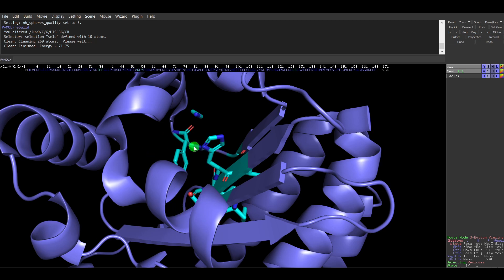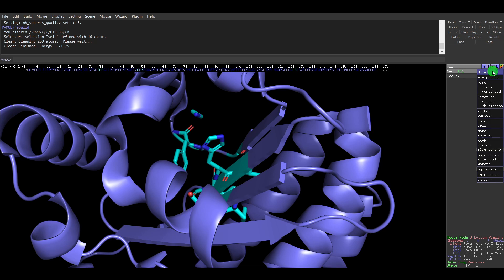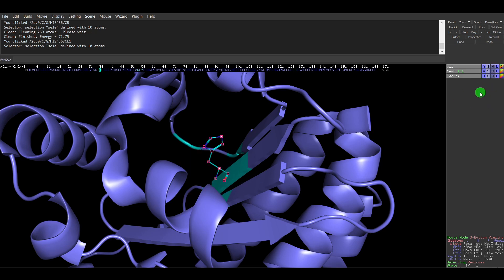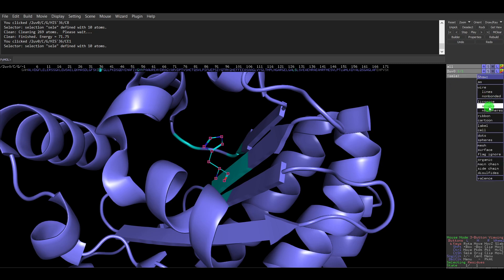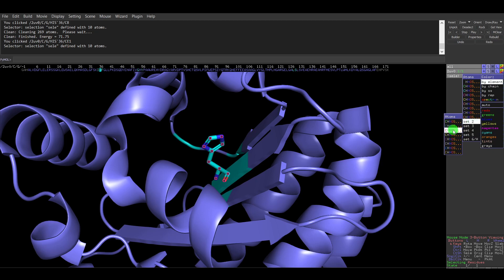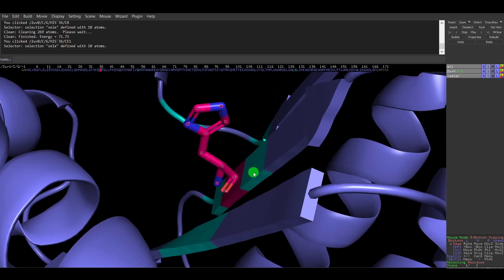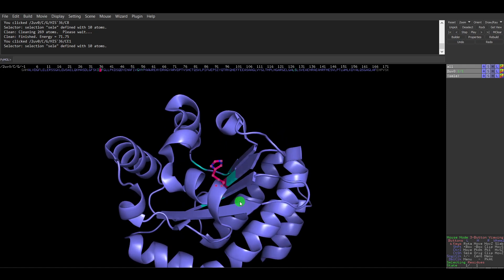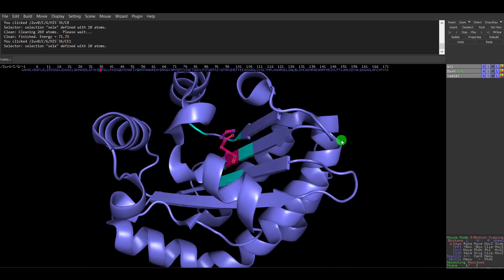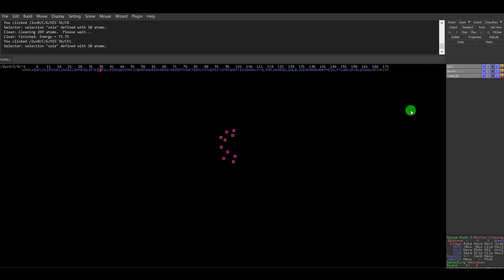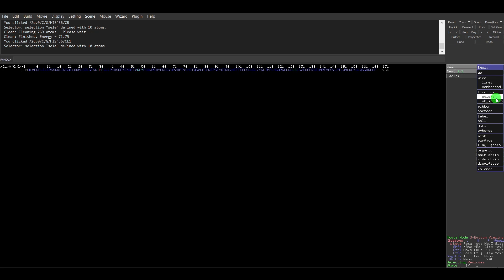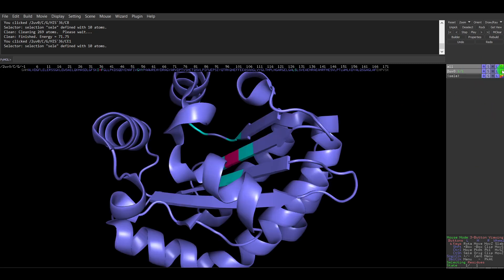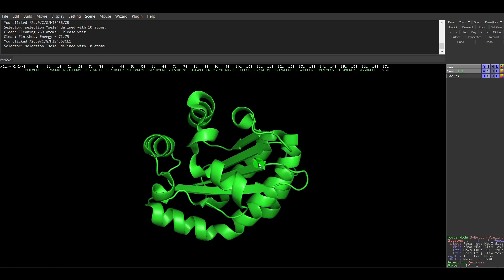Now I'll redo the visualization. I'll go to 'A', Hide, then Sticks so nothing extra is visible. Then I select the mutated residue, show it in stick format, and change its color back to the color I was using previously. The residue is now in a better orientation than before. I'll then select all, hide everything, show everything in cartoon mode, and color by chain.